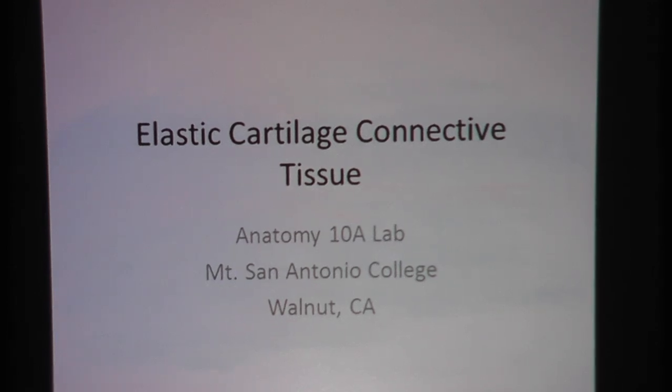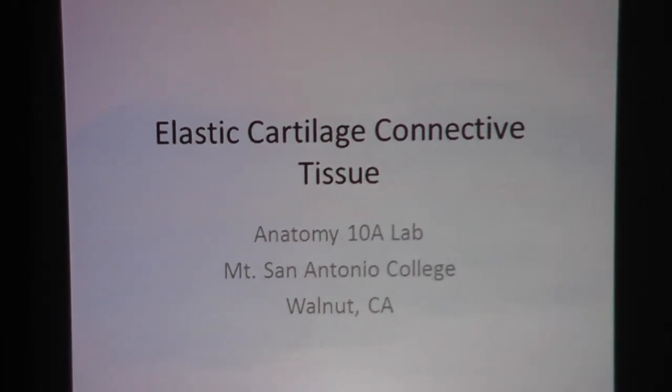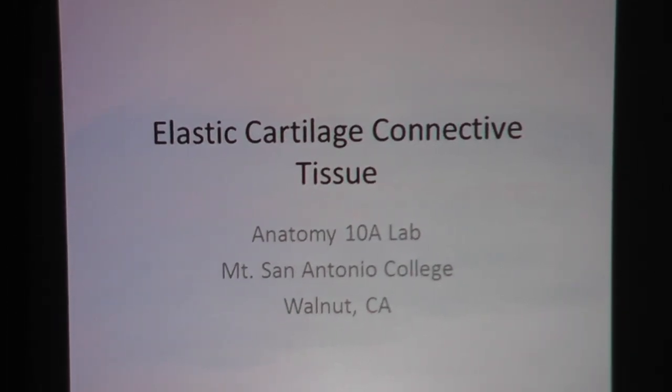Elastic Cartilage Connective Tissue. This is made for Anatomy 10A Lab at Mount San Antonio College.